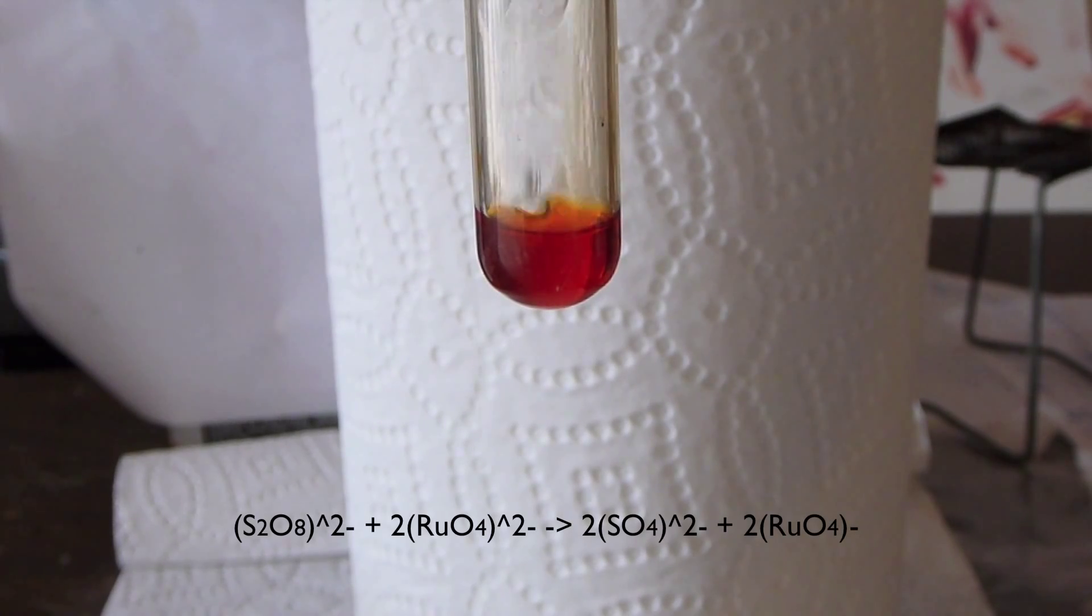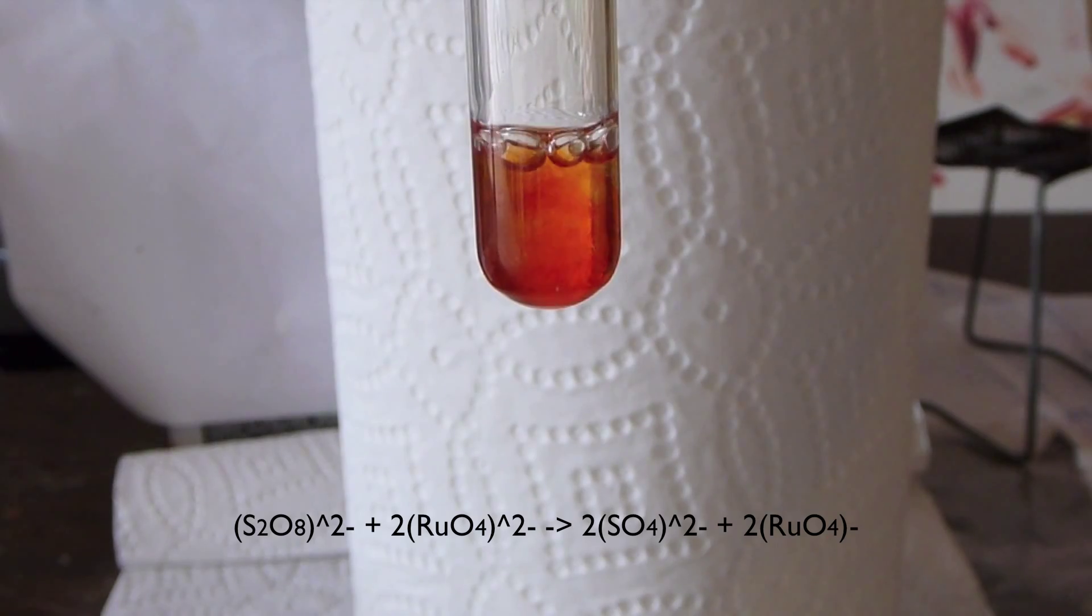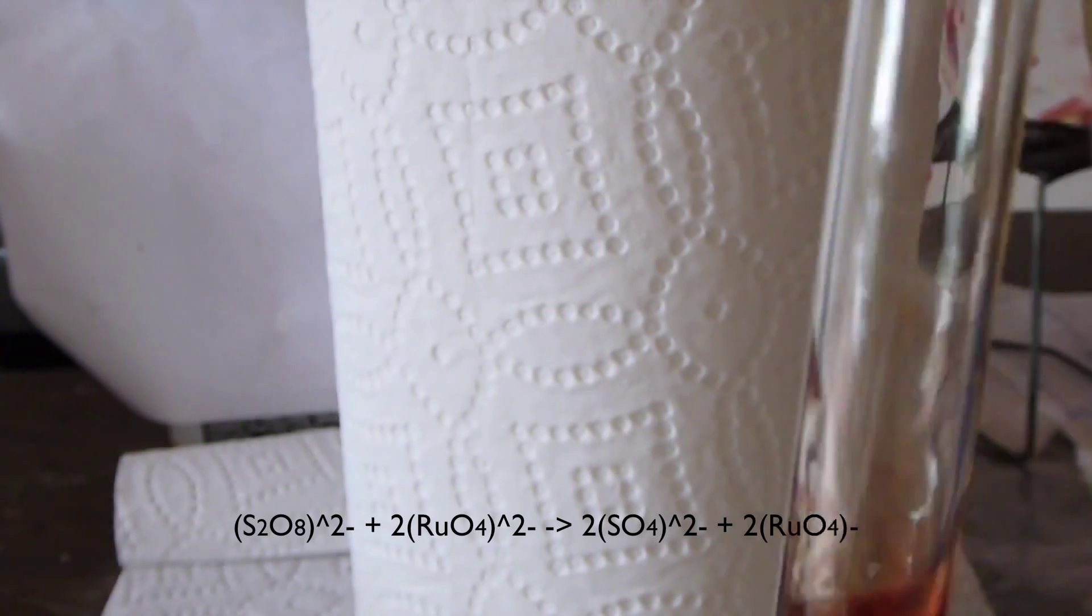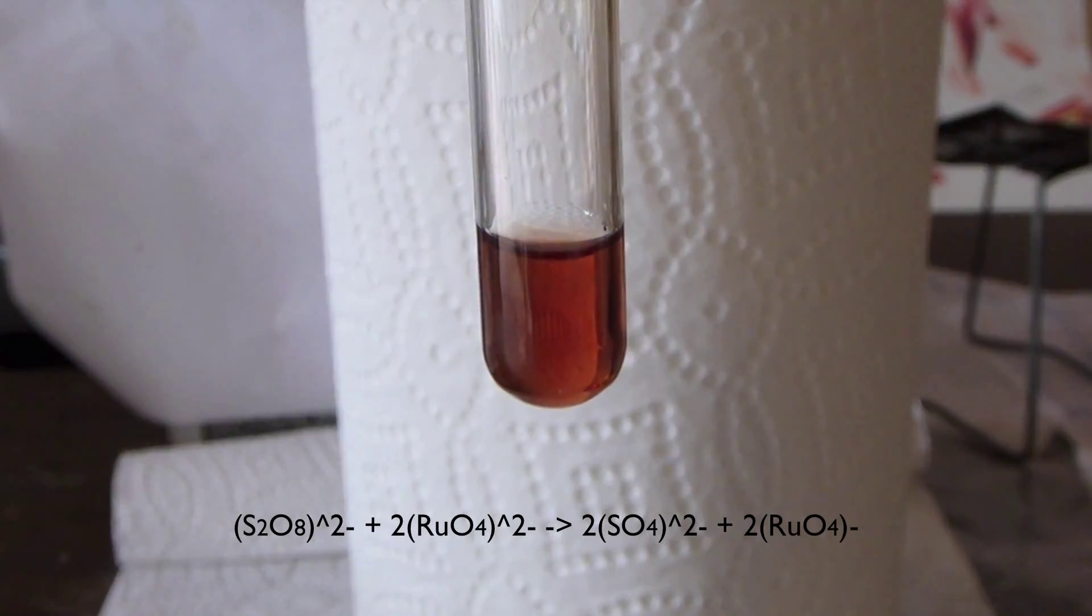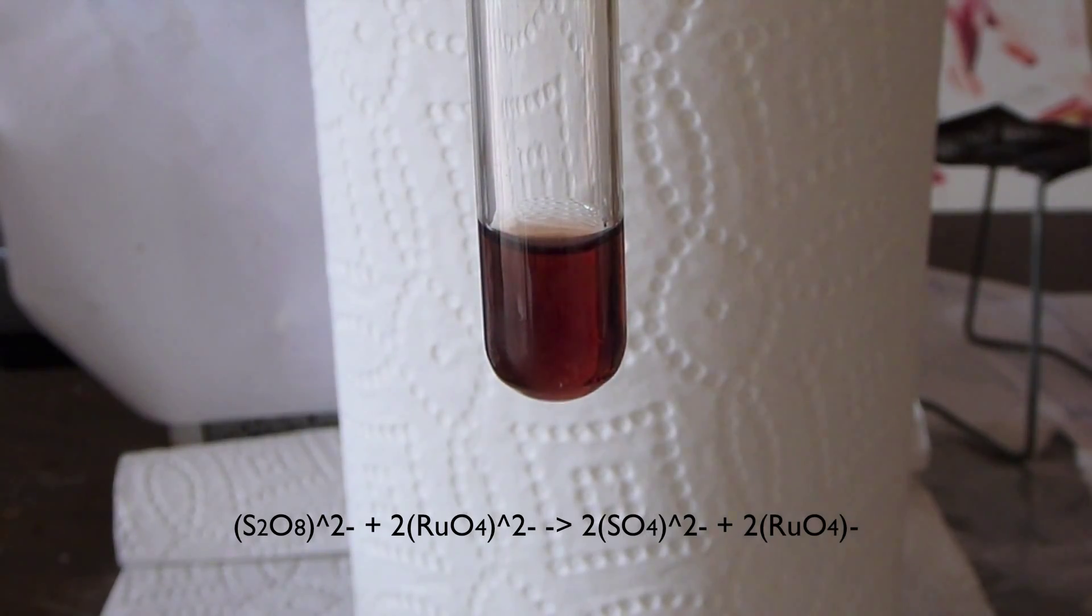So here I am adding the persulfate solution, and already you can see a distinct color change. I'm shaking it up a little bit, and you can see the color has definitely changed, and now the solution proceeds and gets darker and darker. Once it's this kind of inky brown black color, it's pure perruthenate.